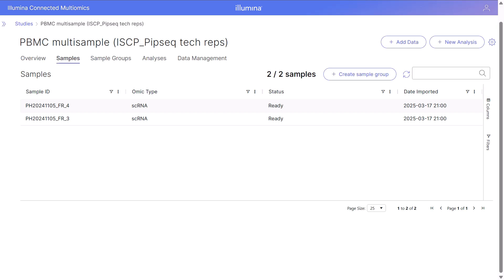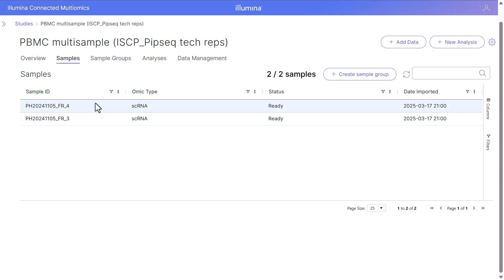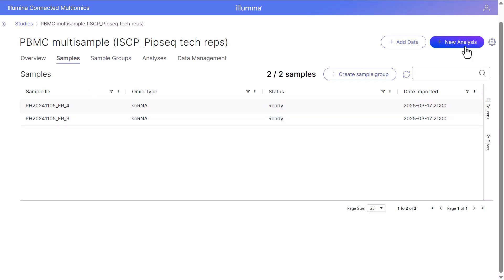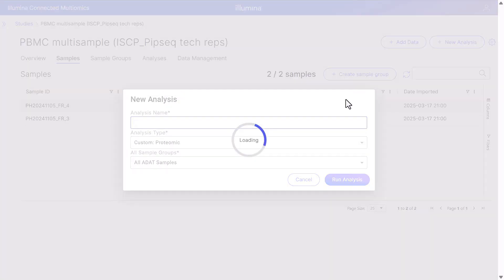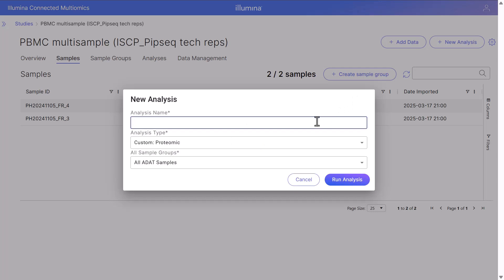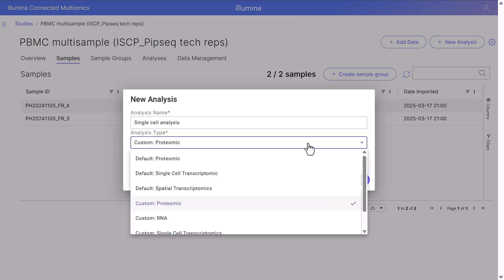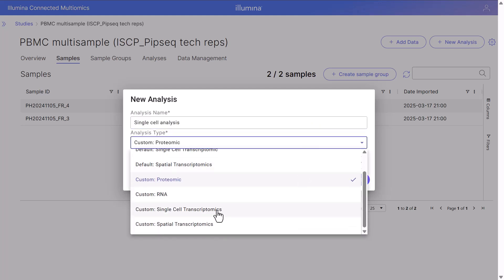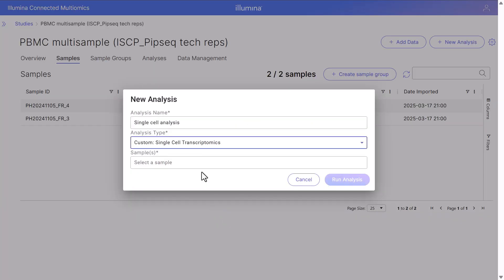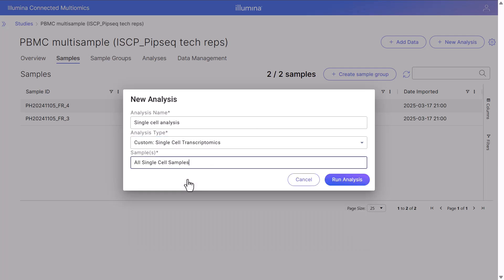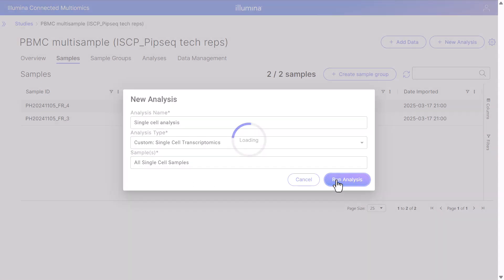Let's walk through single cell analysis. In this study, I've already added my two samples to the project. I'm going to create a new analysis by clicking the new analysis button, give the analysis the name 'single cell analysis', choose my analysis type as custom single cell transcriptome X, and because I have two samples, I'm going to select all single samples and run analysis.